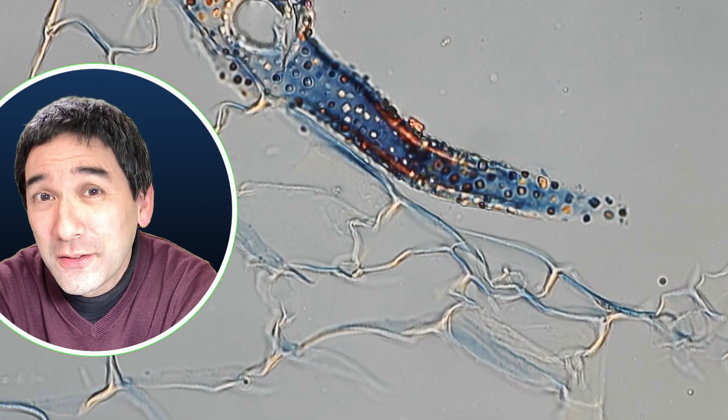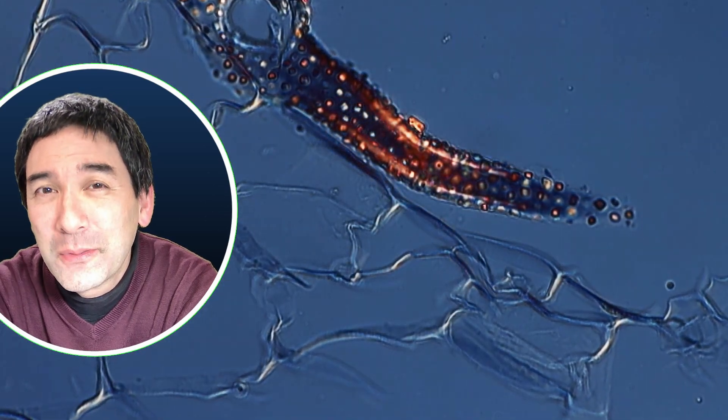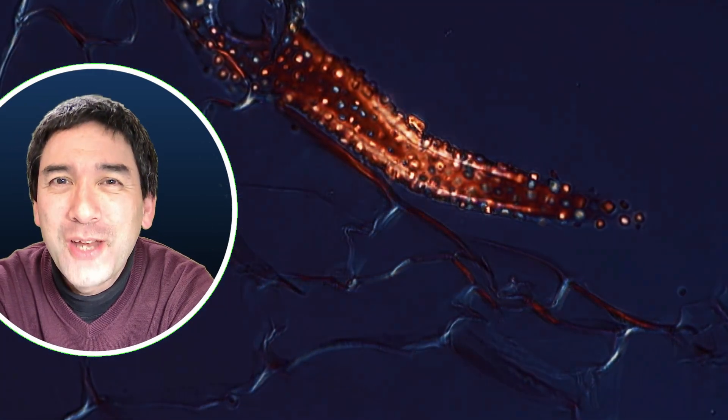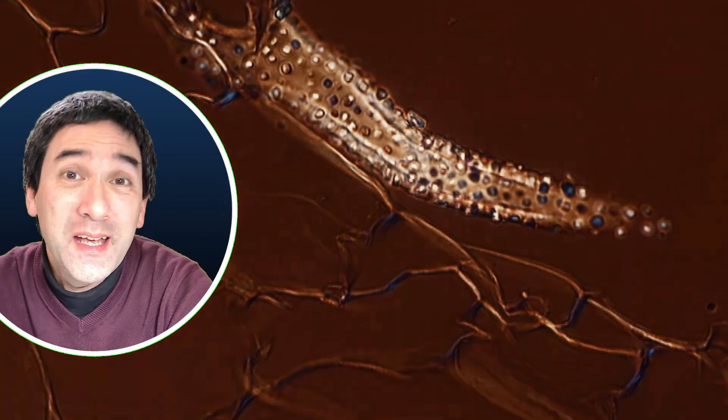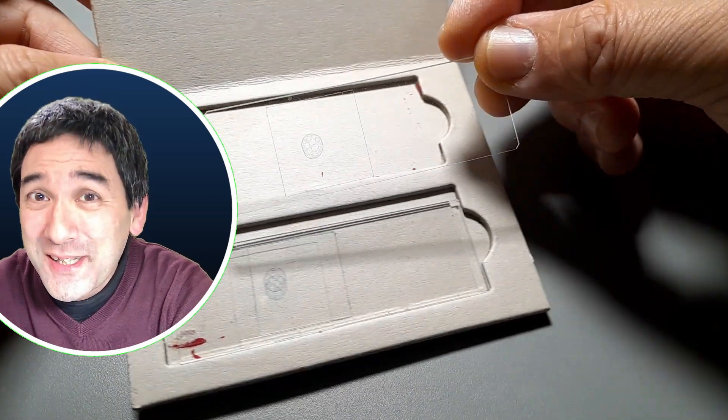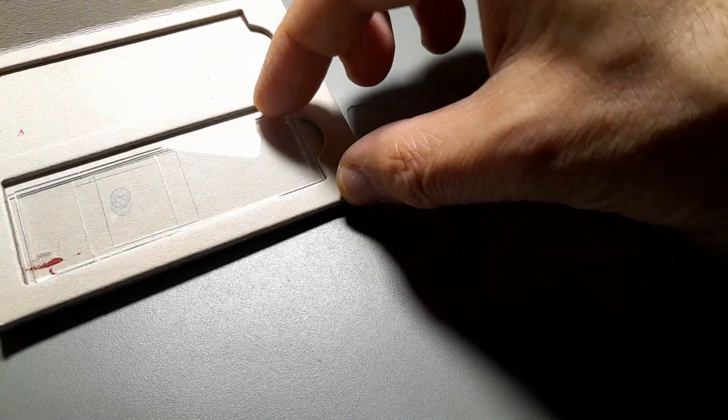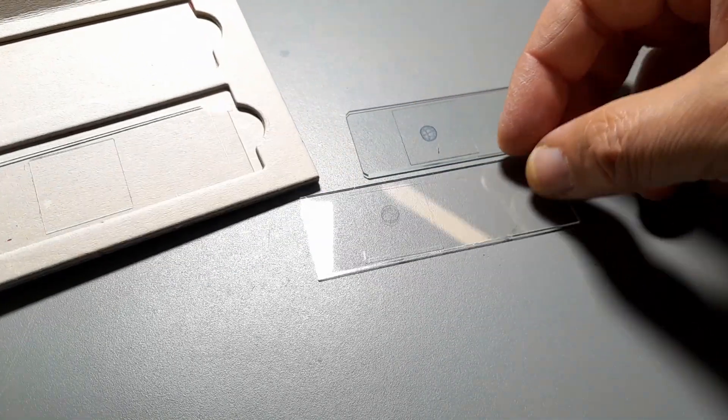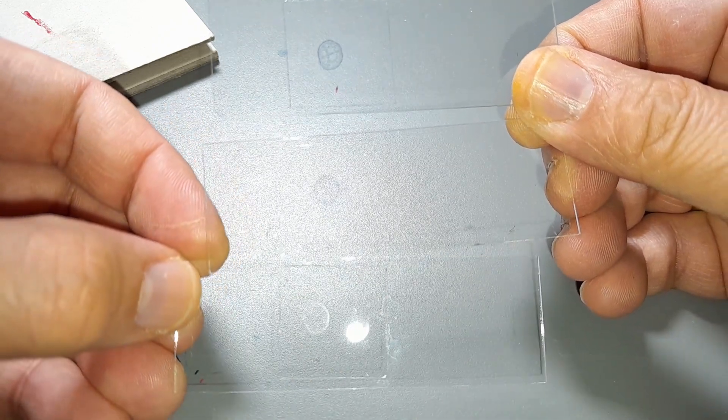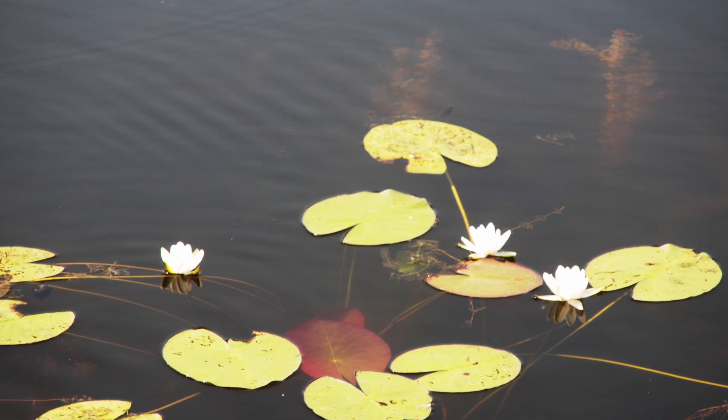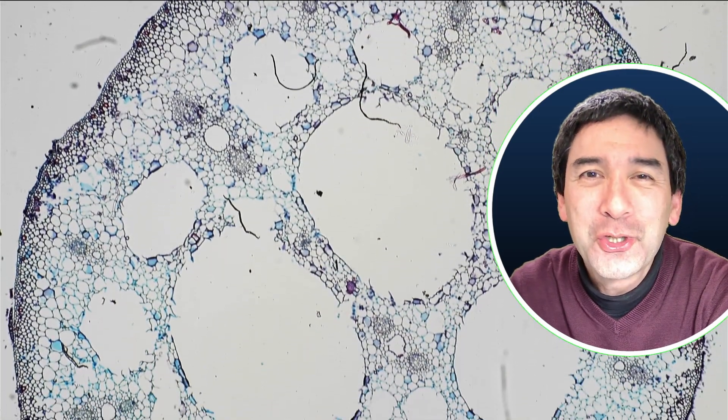Plant crystals, as a matter of fact. I would like to do a little bit of color play with my microscope, so I'll be changing the colors around. But first I need to talk about the background of those specimens. They were a Christmas present - I've got a microscopy friend in Germany who sent them to me. He prepared these slides of the stem of a water lily, and those water lily stems contain beautiful calcium oxalate crystals that we're able to see with the microscope. I would like to simply share them with you.